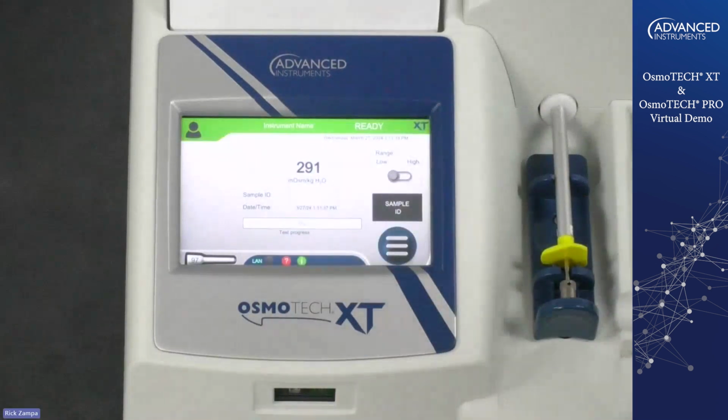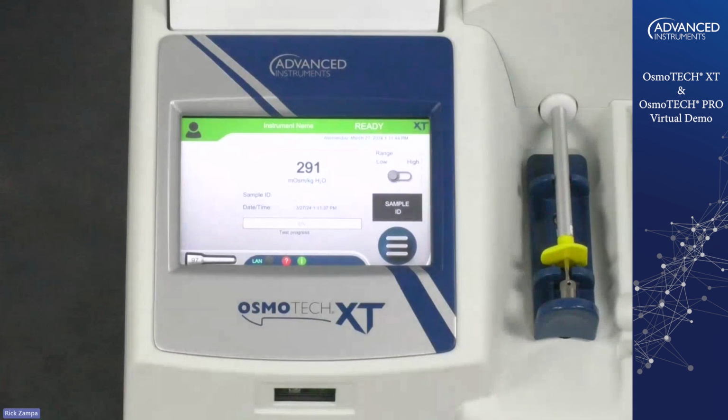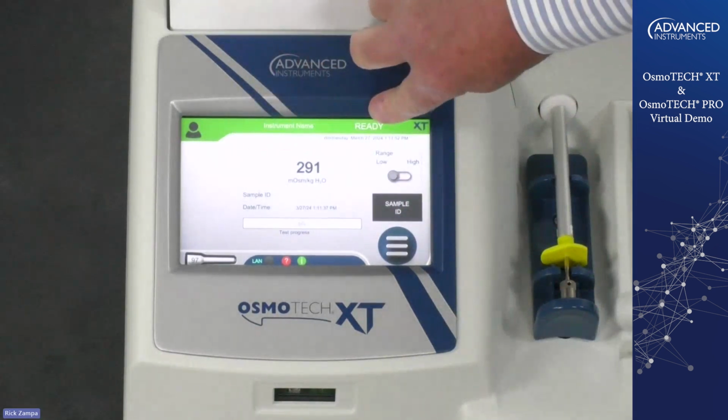So we got a 291. I was trying to get 290, perfectly within range. We're looking for plus or minus 2 on that instrument. So we're well within our range there on this test result. Now you'll see here, you see it flashing red.